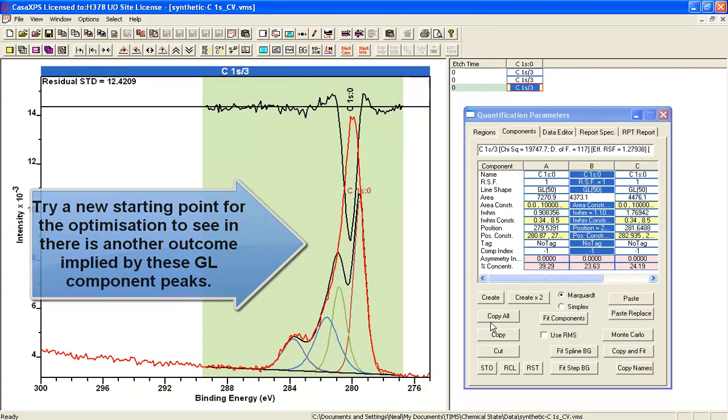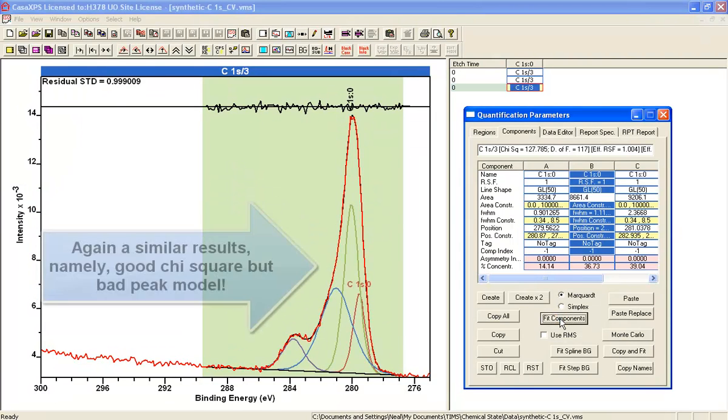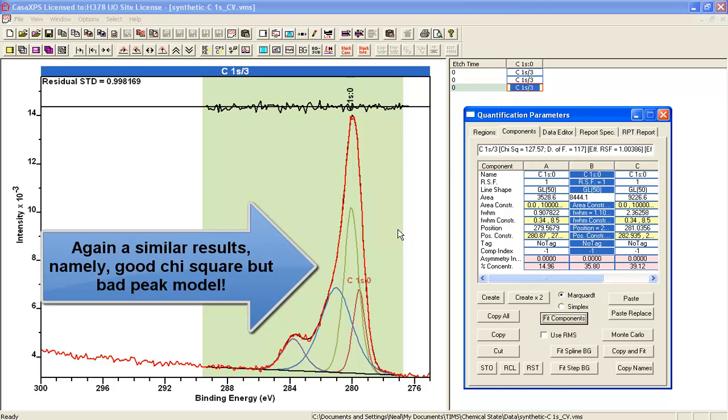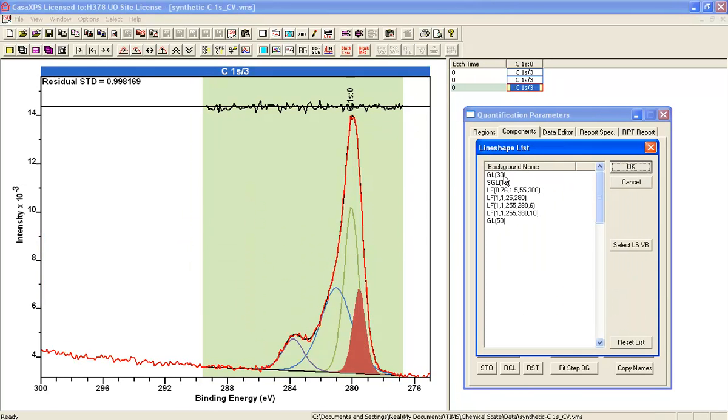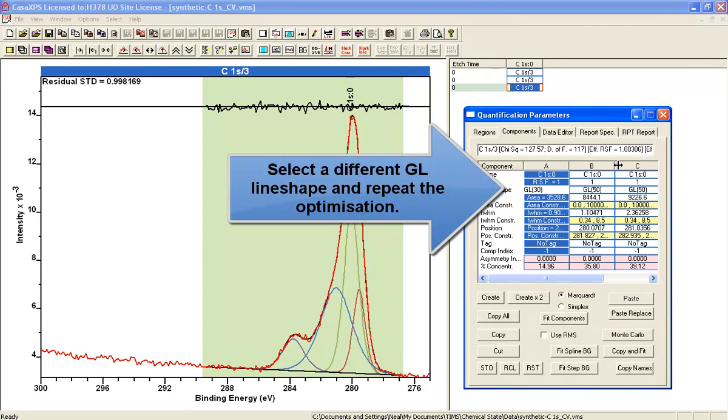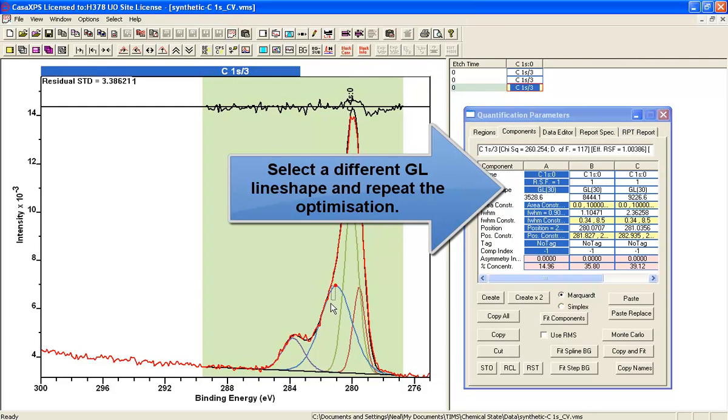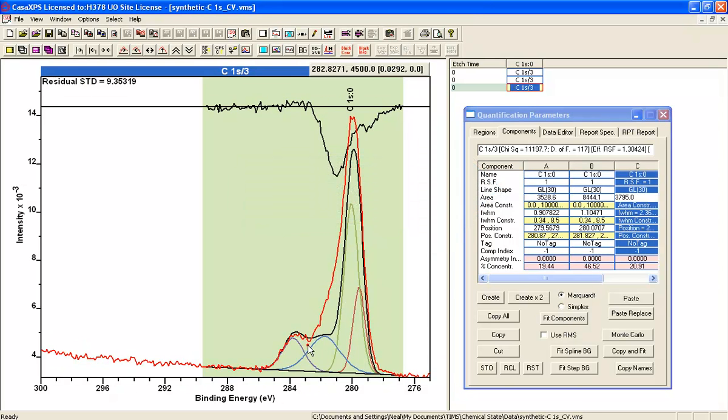So perhaps it was just a starting point. So we'll try a different starting point. And we've come up with, once again, a good residual standard deviation. It's gone back to this shape. So the line shape has influenced the outcome for the peak model. It's not the one that we know it to be. And it has had a significant effect on the outcome.